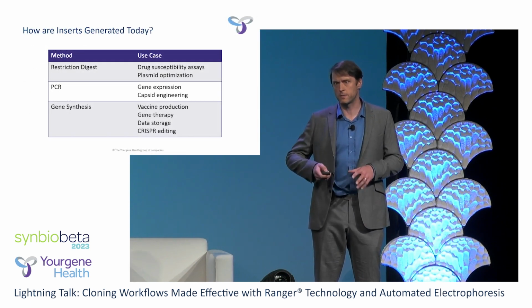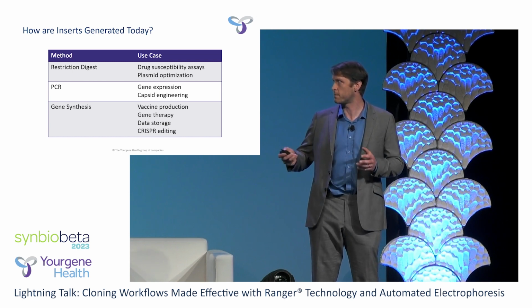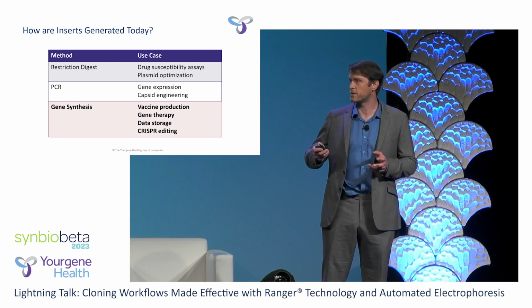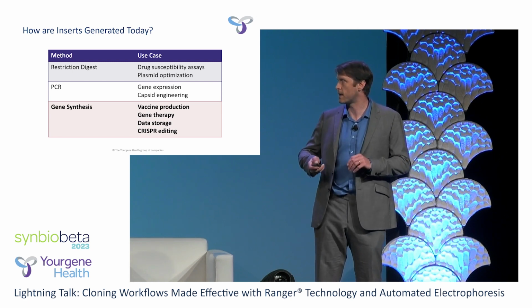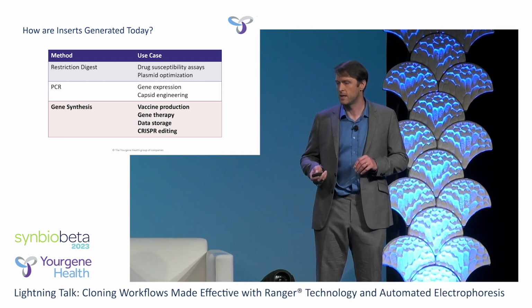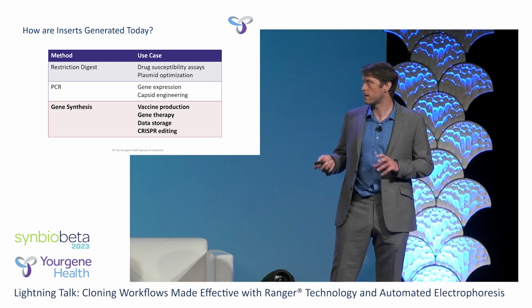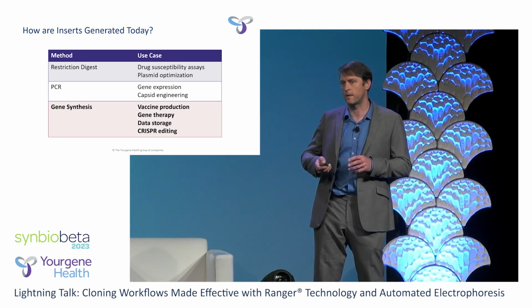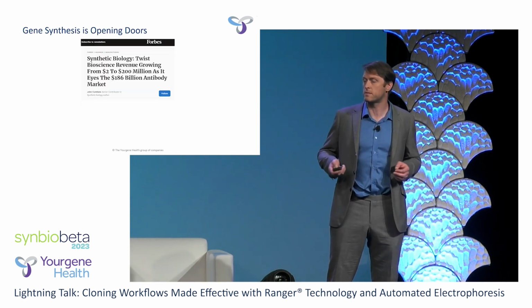So at Yourgene Health, we've got a lot of customers that actually generate these inserts by different means, but I'm really interested in gene synthesis because this is a means of actually generating the insert from scratch. It allows you to really customize it, and it opens up a lot of use case space. And when we talk about what's going on with gene synthesis, there's a lot of technological advancements that are increasing the length and the complexity with which we can fabricate these sequences. And that's leading to a further expansion of the use case space.